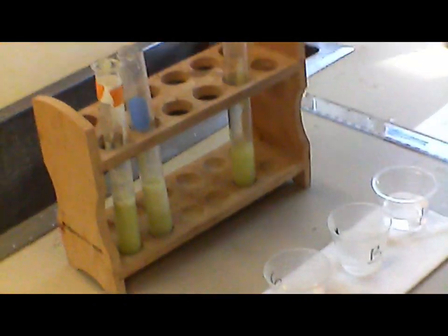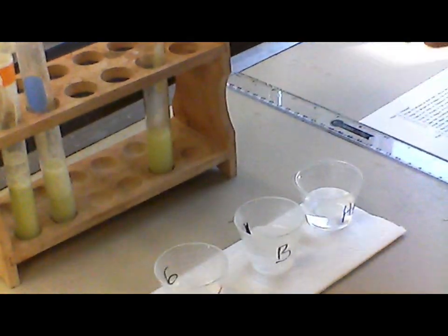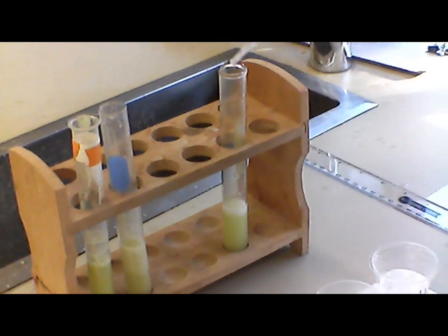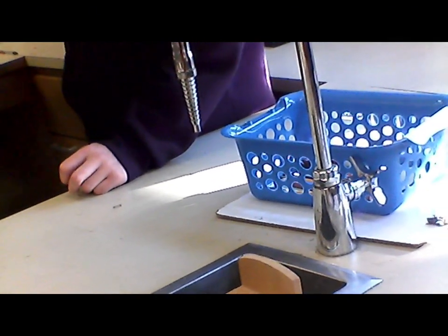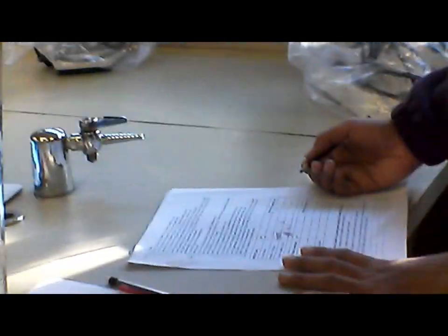Now we put 10 drops of hydrogen peroxide in it. HP? Yeah. Oh wait, hold up, 15? Yeah, keep going. No, wait, it's 10. We gotta measure. Measure it real quick, be quick with it. It's like two and a half? No, it's two. Yeah, it's 2 centimeters.